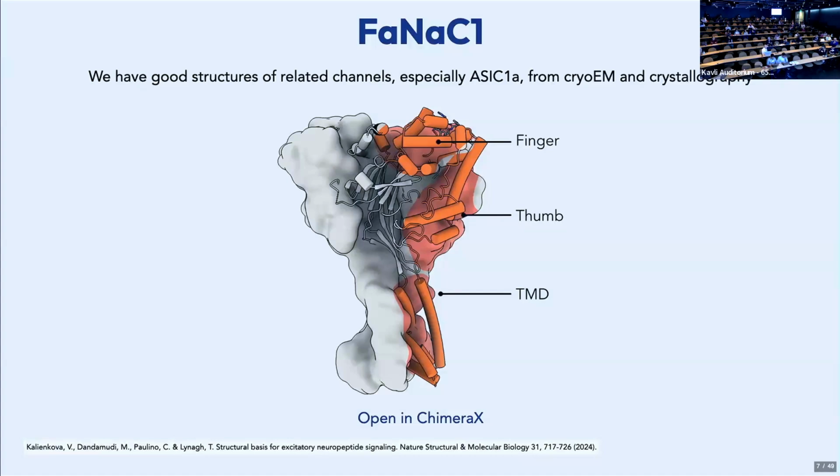But for the purpose of cryo-EM computation, we have to make that assumption. Continuous heterogeneity for cryo-EM really means that the energy landscape has a shallow region where there is a probability of sampling a particle along that region. So the question you have to ask is, do you have any evidence to suggest that the energy landscape is shallow, maybe from some other method, not from the images themselves? Or do you have other knowledge about this particular ion channel or family that suggests you definitely have discrete or definitely have continuous heterogeneity that you expect to see in the images?